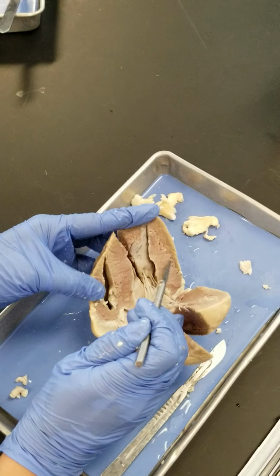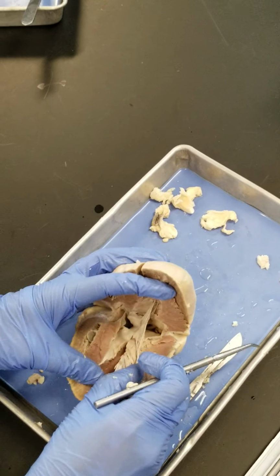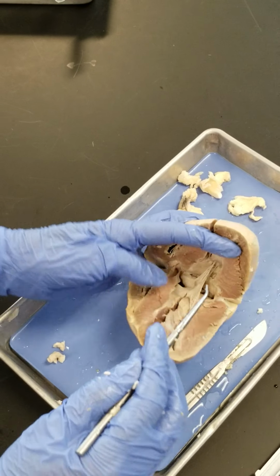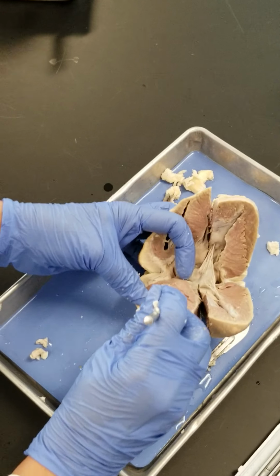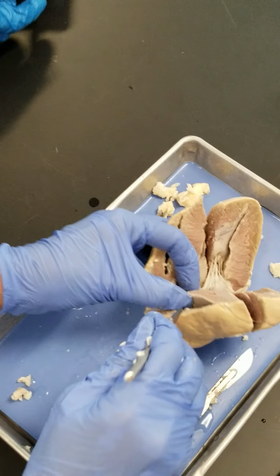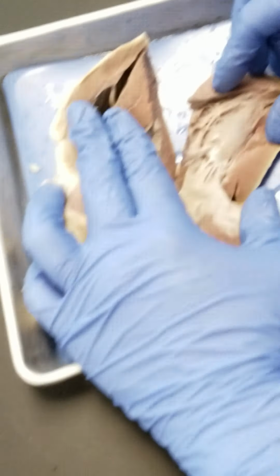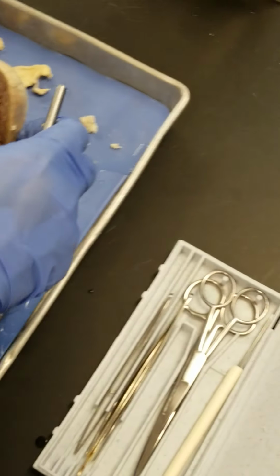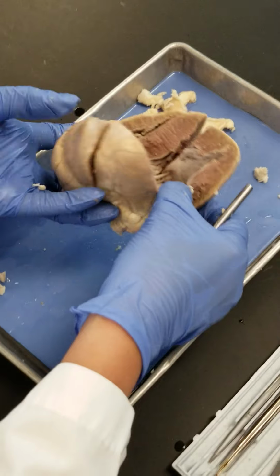What do we call that muscle? Papillary muscles, right? You can see more papillary muscles on this side that have been cut here, but on some of your cuts, I'm sure that you got a good example of papillary muscles. Look at this one. Yeah, this one, you see? That's very big, a good one. Yeah, you can take a picture of that. Very good. So what else do you need from the inside of the heart? That's it. So you have everything from the outside.